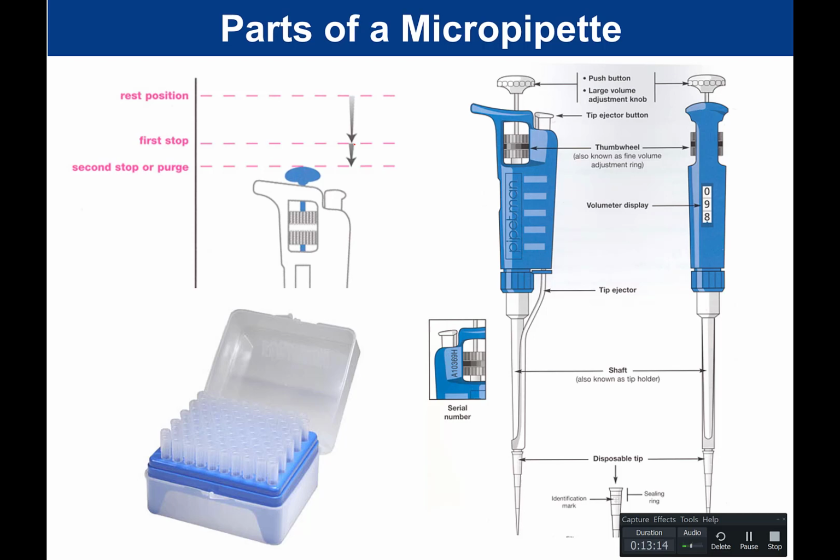But otherwise, I don't want to push to the second stop. If I push to the second stop when I'm trying to draw up liquid, I'm going to pipette too much. It's not going to be accurate.